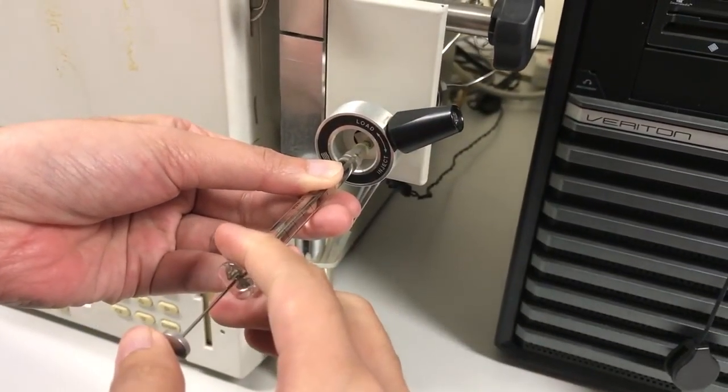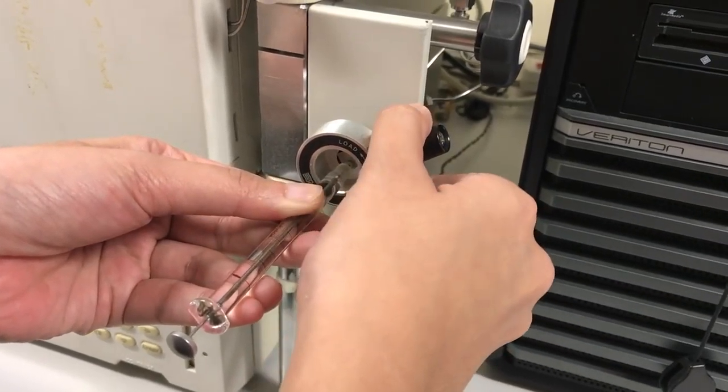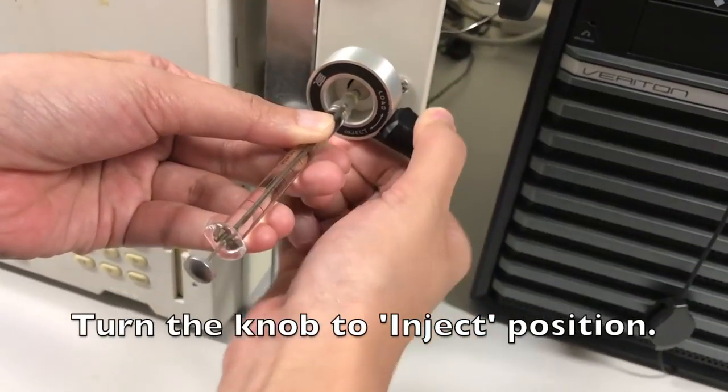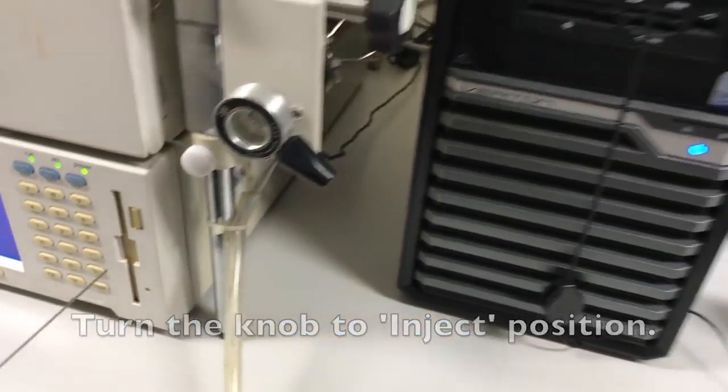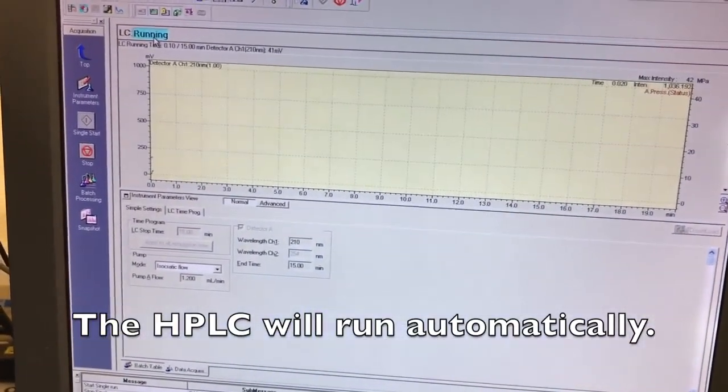While loading, make sure that your hands are not shaking and do it one shot. This is to prevent any air bubbles. Then after that, bring it down and take out the needle. At this part, the machine should start running by itself.